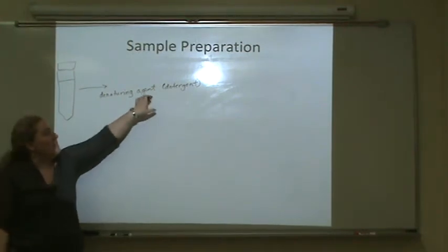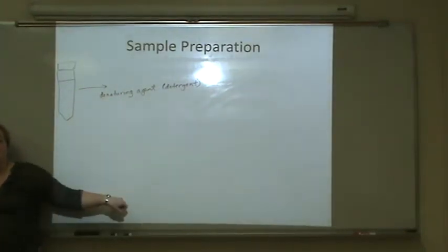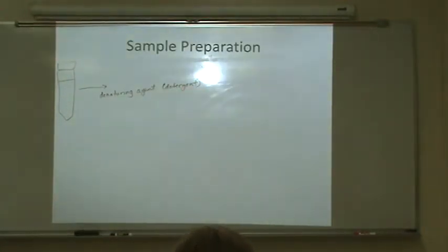How would that denature a protein to start with? I was still talking about separating, sample prep. Okay, are we still in the part where we're separating the protein? I've gone back a little bit to talk about, let me show you what's coming next. Before we can load things into a gel to do the separation, there's a few things that we have to add to the sample. So I got a little bit ahead of myself, but that's a good question.